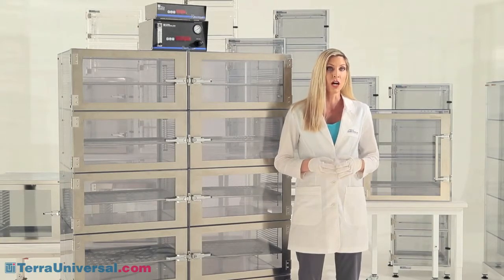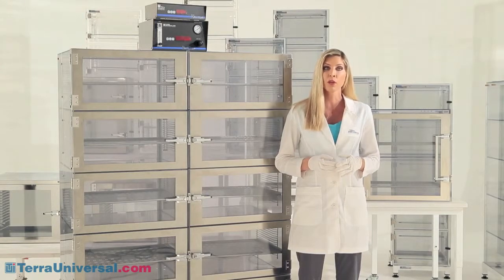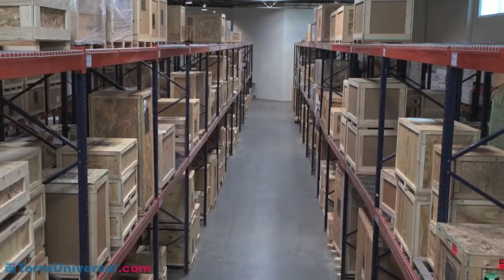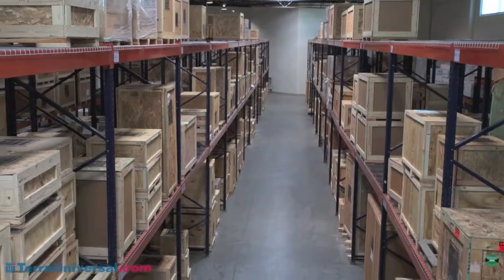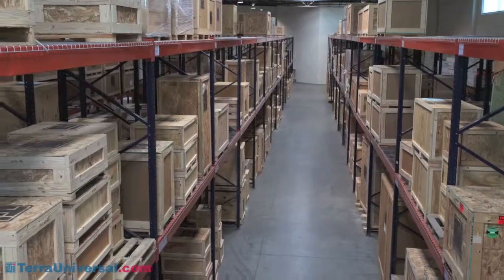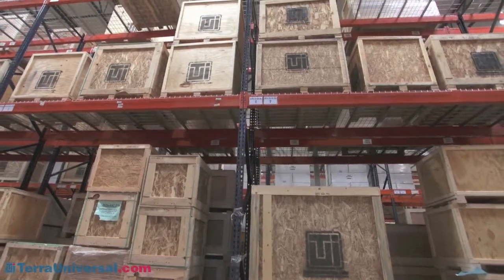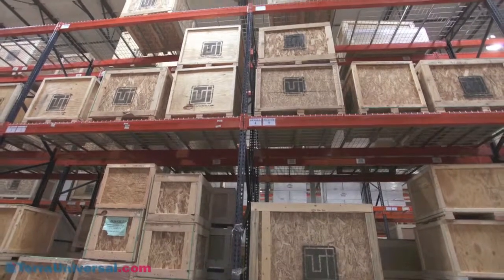Visit TerraUniversal.com to view other videos that provide more information on these control systems. Terra stocks dozens of these models for next-day shipping at its Fullerton, California manufacturing facility. To order, or for more information including pricing and lead times, visit TerraUniversal.com.